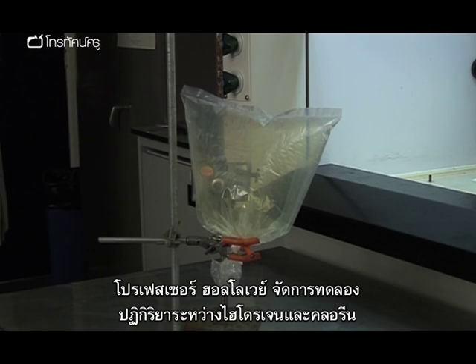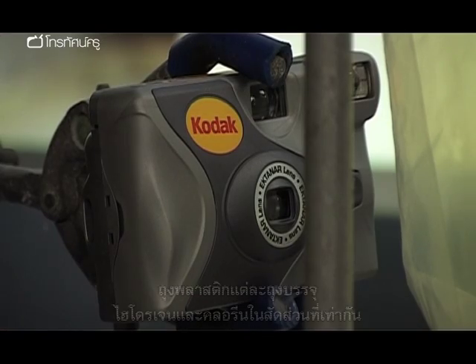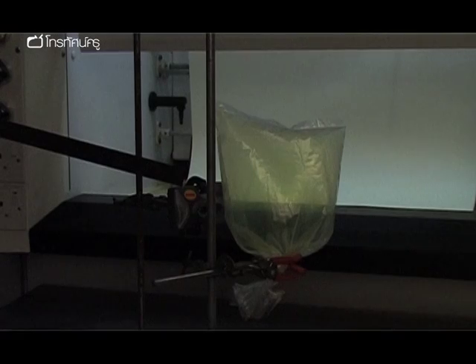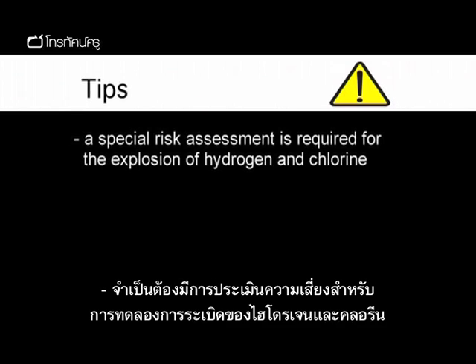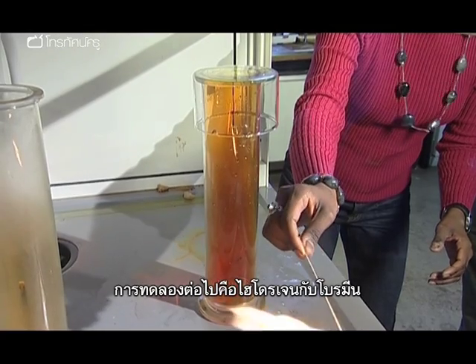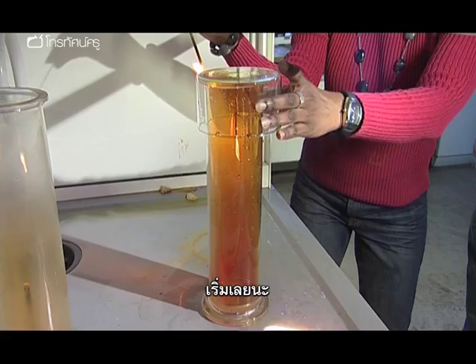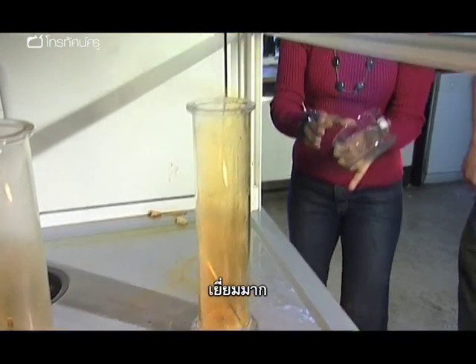Professor Holloway also set up the reaction between hydrogen and chlorine. The plastic bag contains equal volumes of hydrogen and chlorine, and all it needs is a flash from a camera. Next up is hydrogen with bromine. Bob prepared equal volumes of hydrogen and bromine in this gas jar. Here we go. Fantastic.